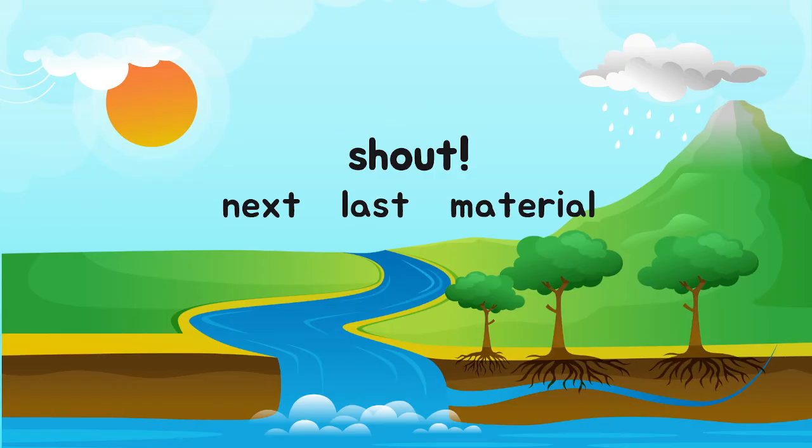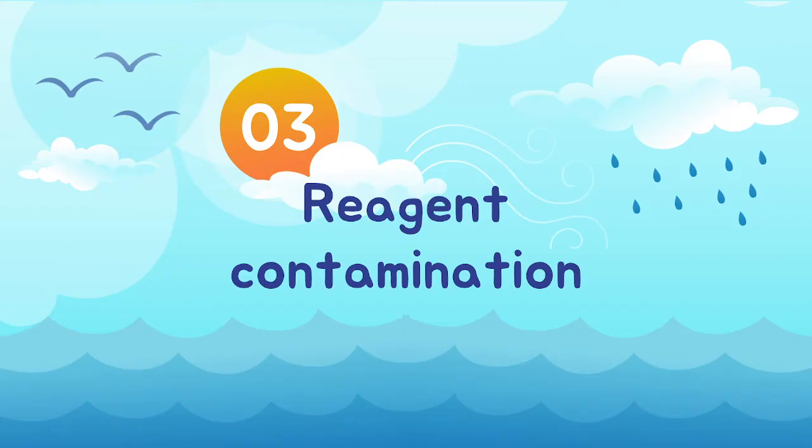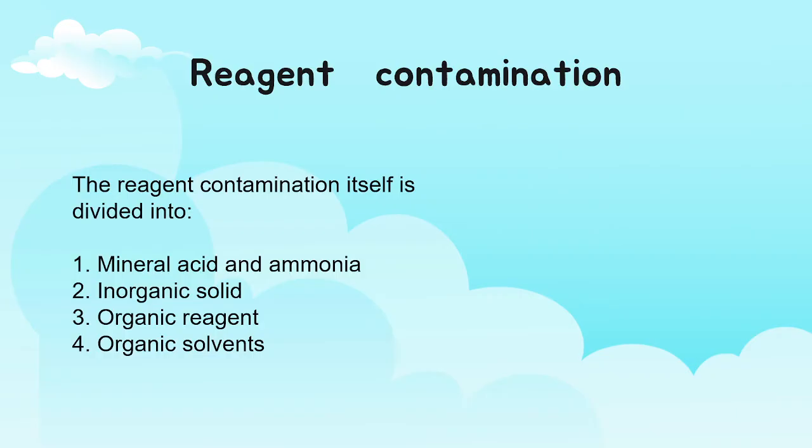So next, the last material: 3. Reagent contamination. The reagent contamination itself is divided into 1. Mineral acid and ammonia. 2. Inorganic solid. 3.